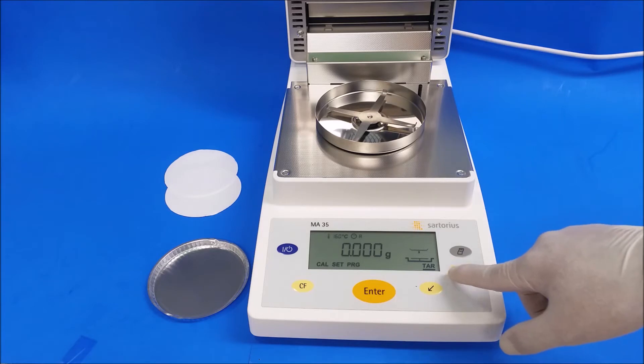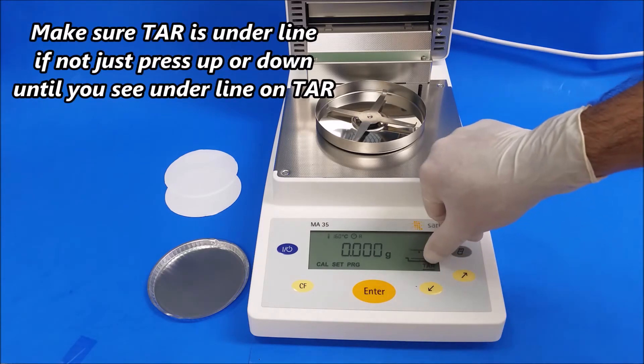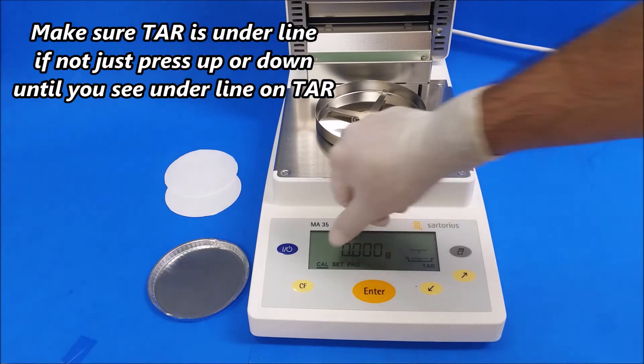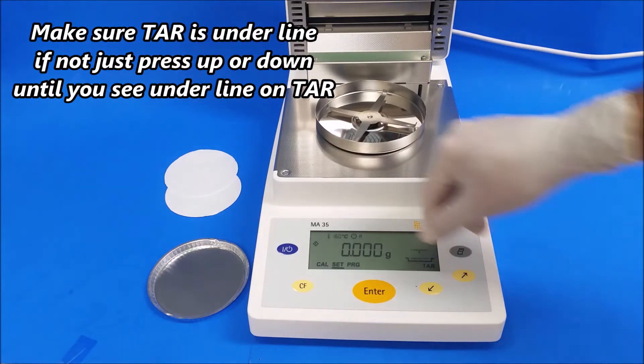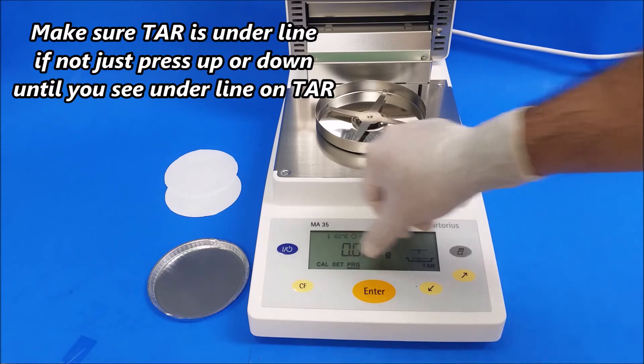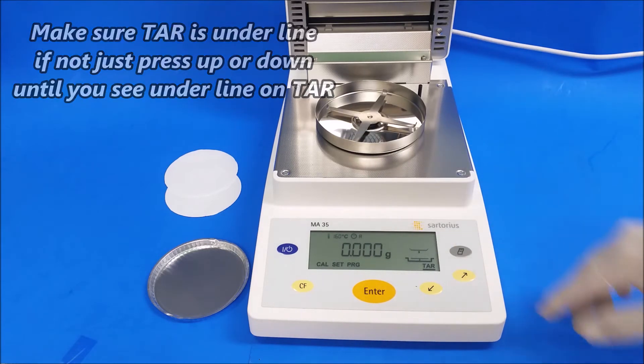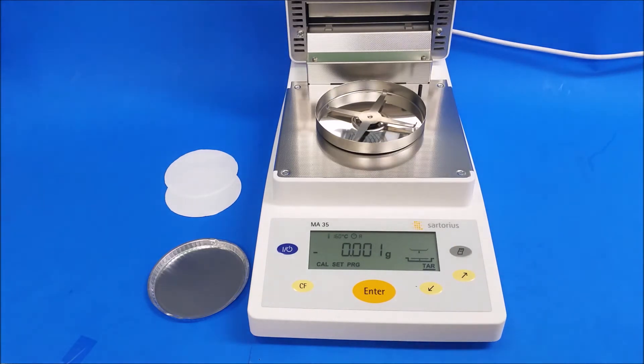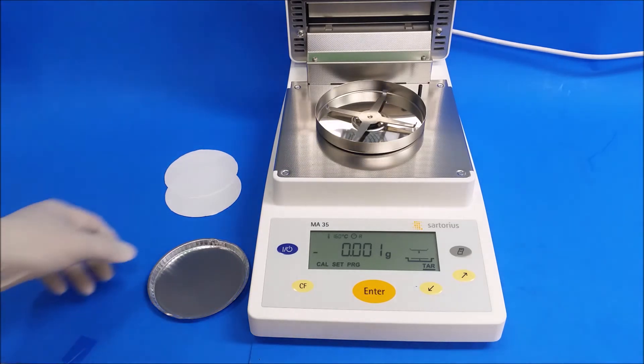Make sure it's underlining tare and set the program you want it to be in tare. Now I'm going to put in an aluminum dish and two fiberglass pads.